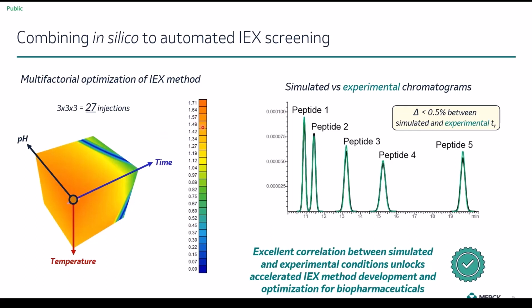And we were able, therefore, to obtain a simulated chromatogram that ensured the best resolution, and therefore a further resolution between the two early eluting peptides in our case.